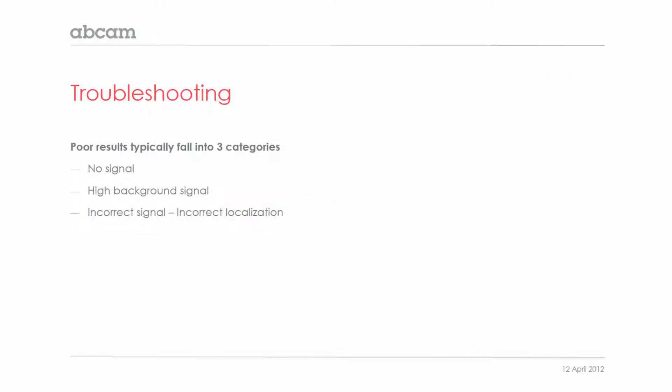There are three main problems you can get in ICC. Perhaps you might have no signal at all in your sample, you might have high background with lots of fluorescence, or you may have an incorrect signal — you've got it in your cell, but it's not at the localisation that you're expecting. What can we do about these?